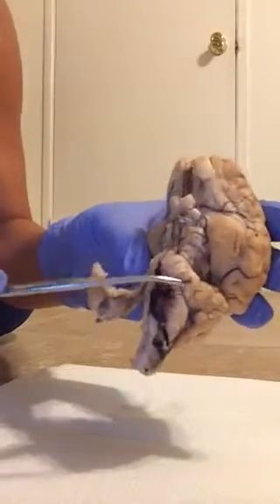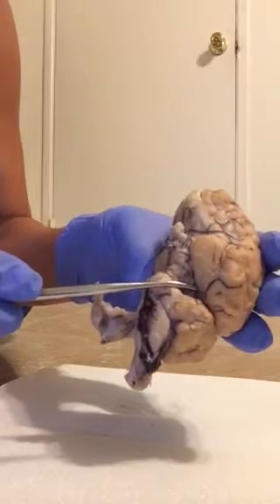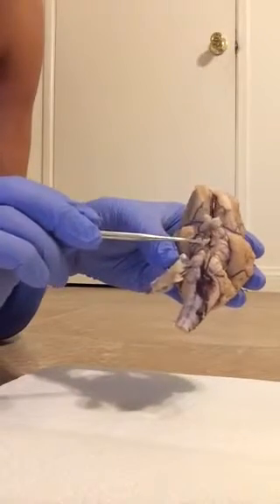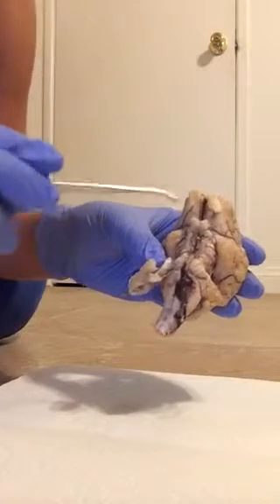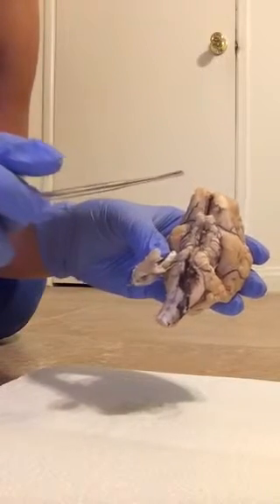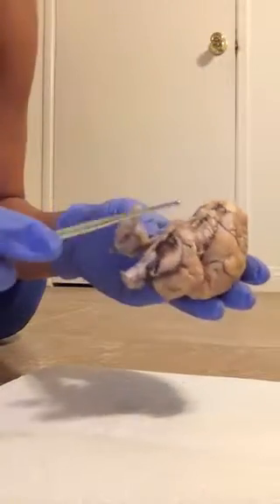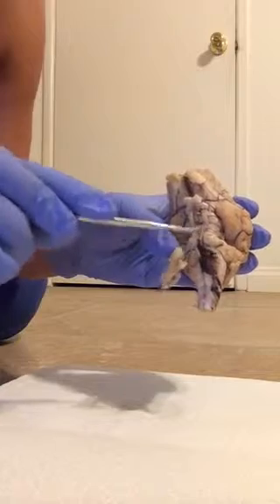Not sure if you can see it very well. And we have the larger oculomotor nerve, two of them here. And we have our abducent nerve, which is one of the smaller nerves. It's going to be about right here.